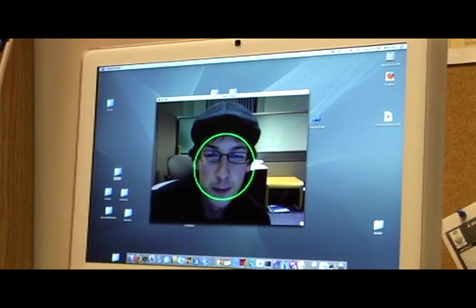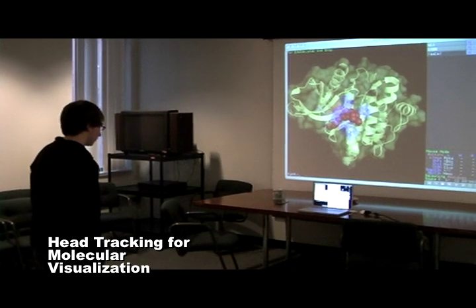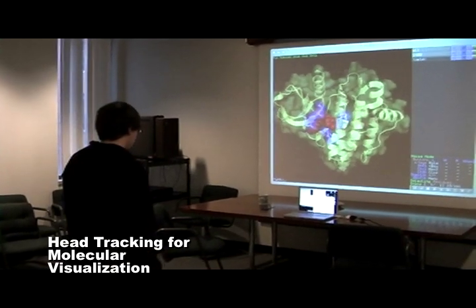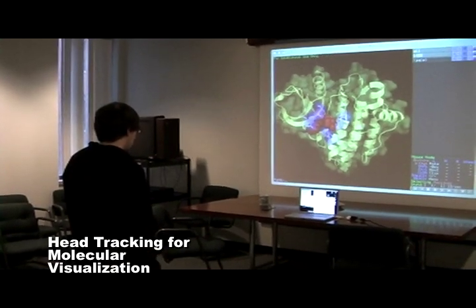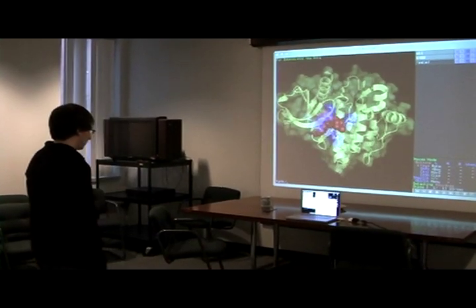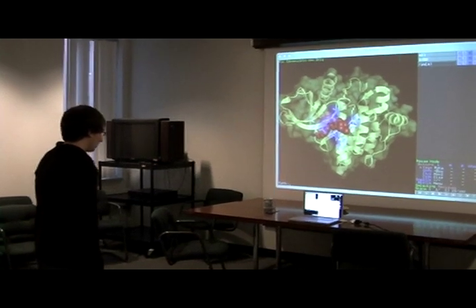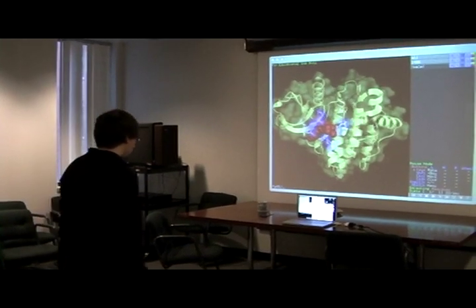Here we demonstrate how a user could interact with PiMole. Using only head tracking, the user could move around in 3D space and view the molecule from different angles and points of view.